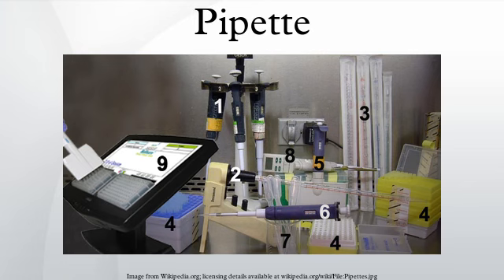Several different types of air displacement pipettes exist: adjustable or fixed, volumes handled, single-channel, multi-channel or repeater, conical tips or cylindrical tips, standard or locking, manual or electronic.